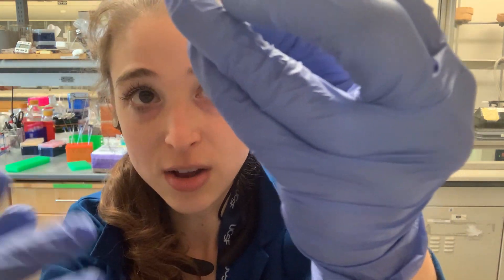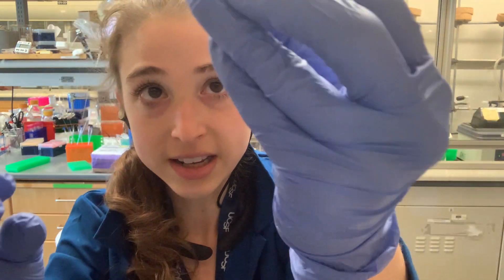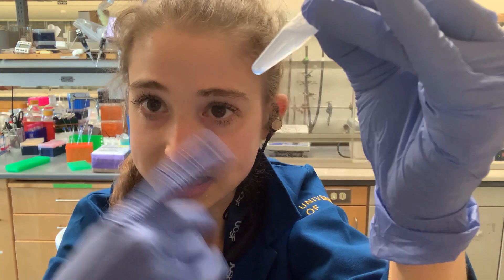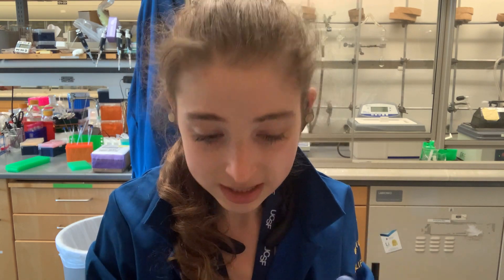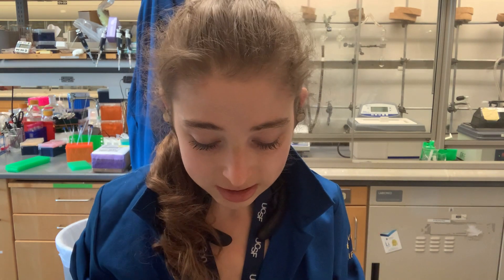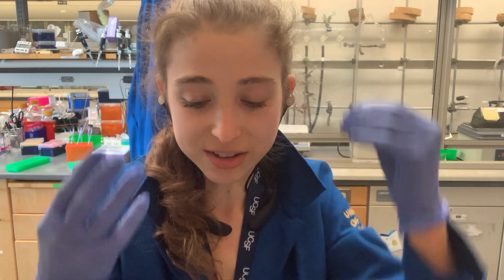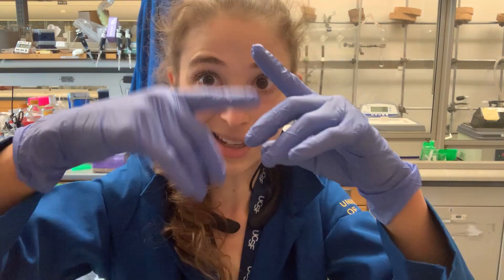If you have a really viscous solution, like something with glycerol in it, you might need to give the finger flick a little help with some inverting and pipetting. Then once you get things going, you can establish that vortex-like motion with your fingers. Sometimes you might get bubbles, or liquid stuck on the top — especially with a real vortex you might get liquid stuck on the lid if you're extra vigorous. Then you can stick it into the minifuge afterwards to spin things down.